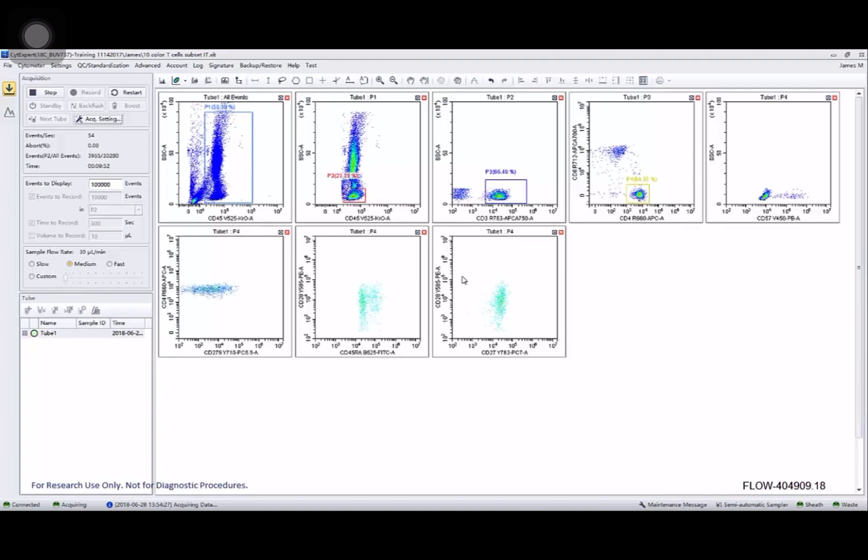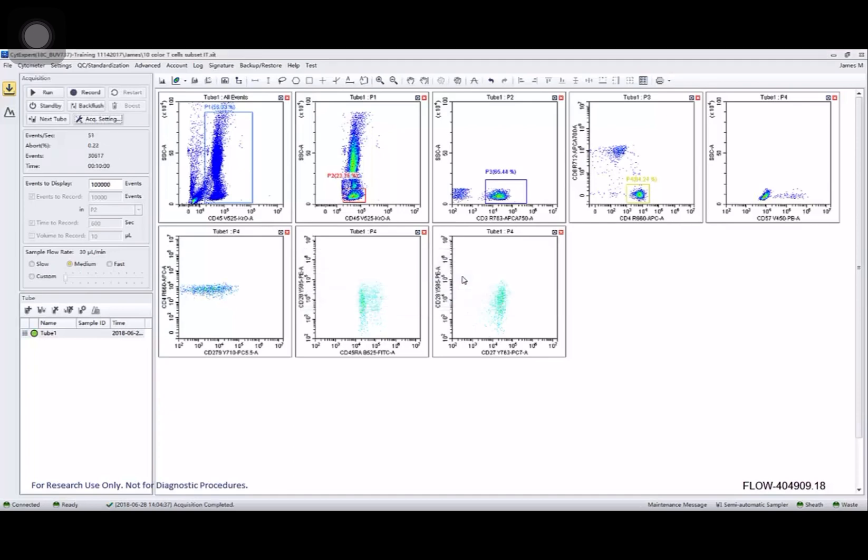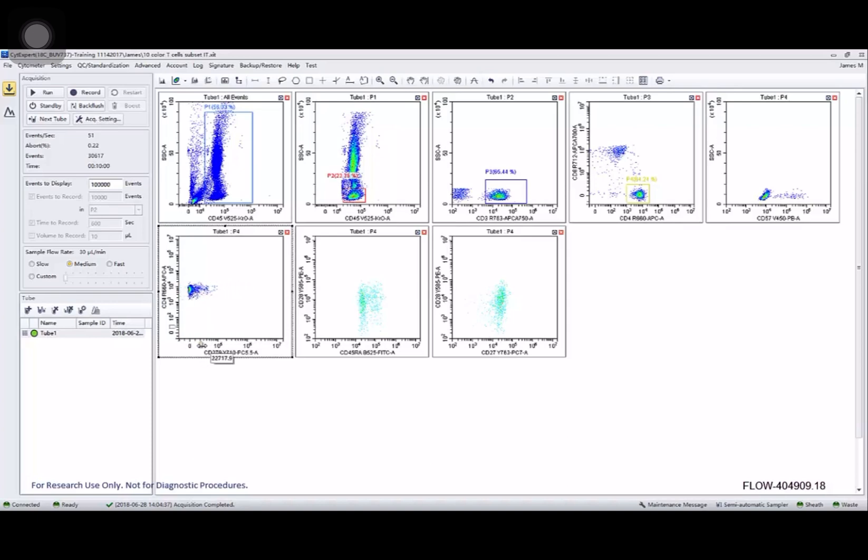Okay, fast forwarding a bit. There's quite a bit more data. These linear to log sliders are really convenient.